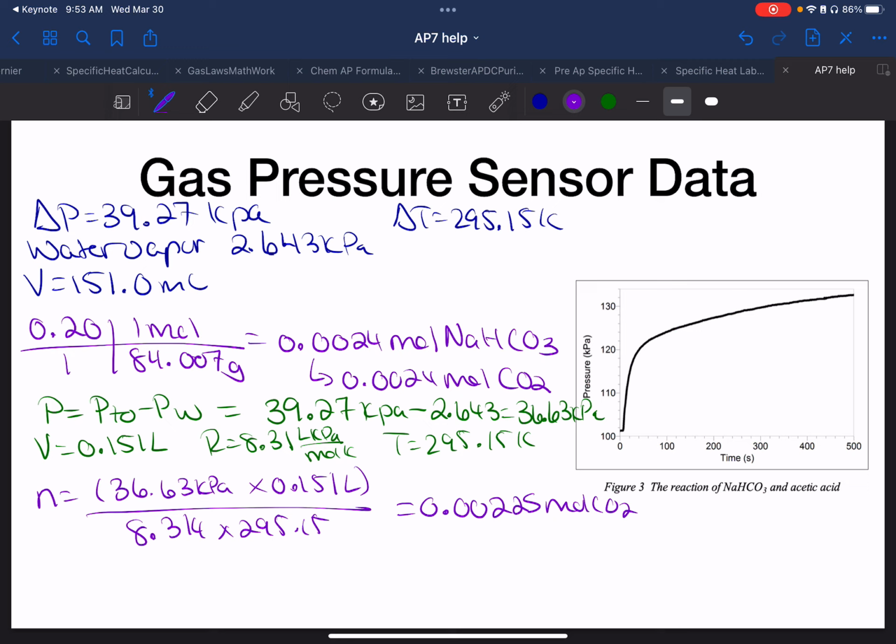Additional information, hopefully you can see the different ways of testing for mixtures of sodium bicarbonate and sodium carbonate. They have their advantages, they have their disadvantages, and they have their sources of measurement error. Okay, each one has their problems, and I want you to think about the problems you had for each one. Okay, and that's how you do your lab calculations.